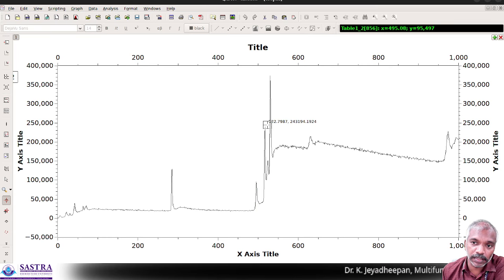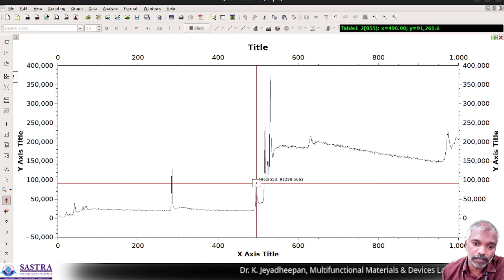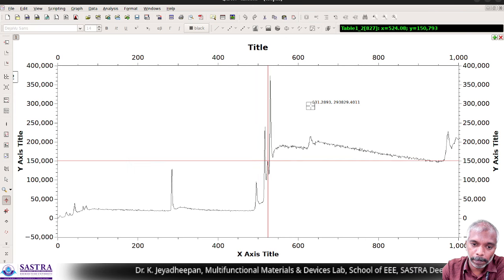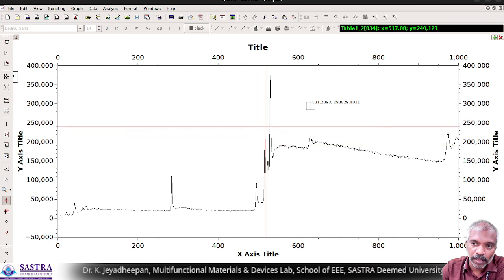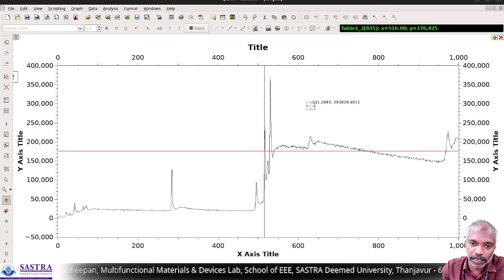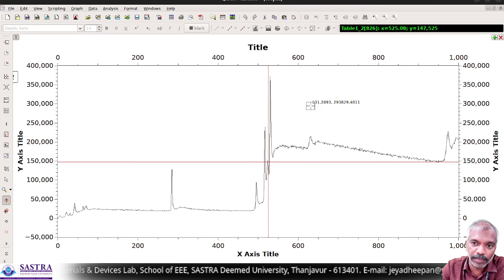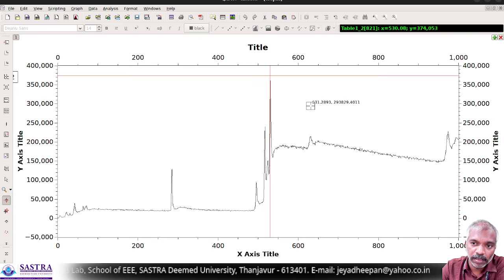And here it is 517.08. And here another peak is there, that is 524.08. And here it is 530.08, like that, right?